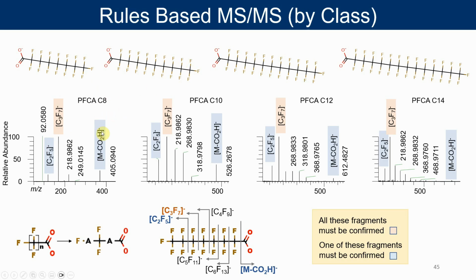so in this case, this is called rule-based annotation. And we and many authors have shown this for different fields as well as lipidomics, other fields where we're also using rule-based annotation. So saying, I need to see this and that fragment and the accurate mass, that if done right, you can get less than 5% false positive rate. So that's very exciting.